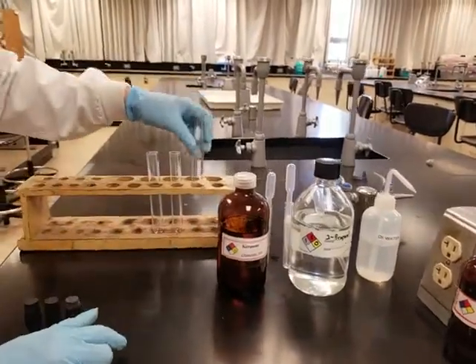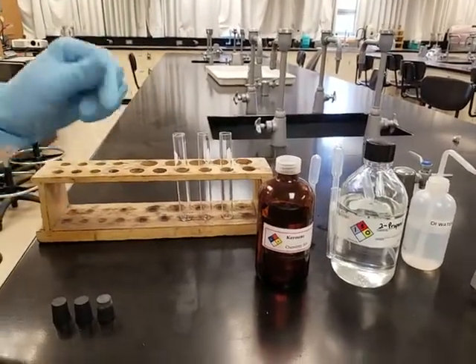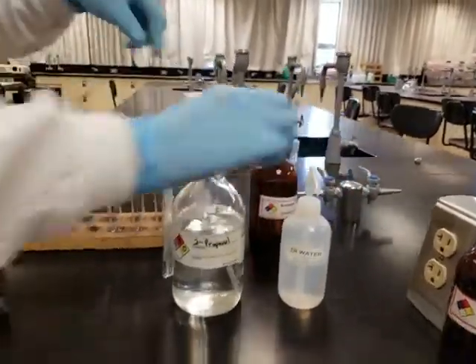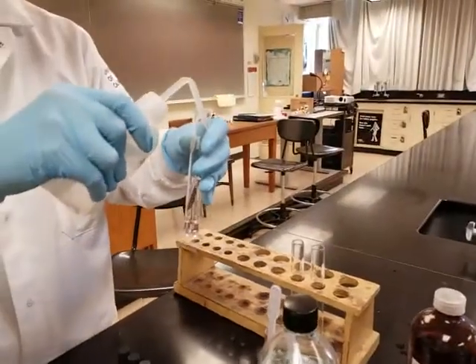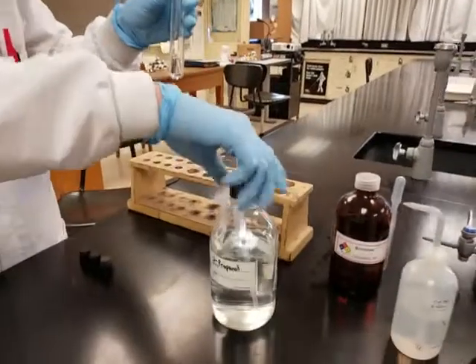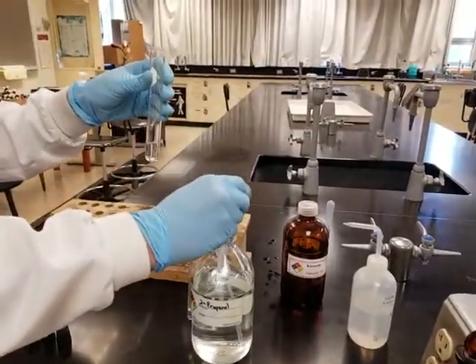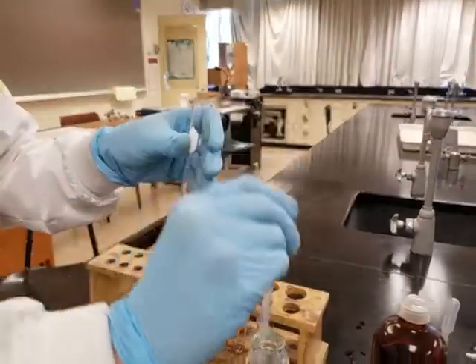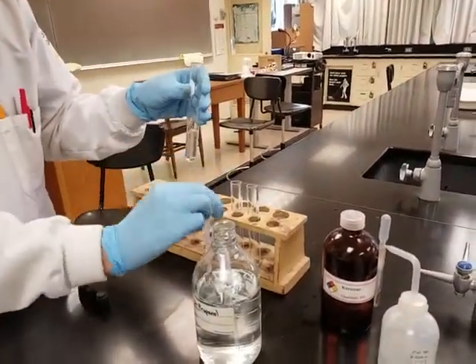Okay, so let's go ahead and get started. That's the whole idea. First up, we're going to have DI water and isopropyl alcohol. These are the two stars of the first test tube. I'm going to put some DI water in, approximately 1 ml. This is more than 1 ml, but you can have a better look at it. And then here is 2-propanol. We're going to get approximately the same amount of isopropanol, about this amount. Allow it to mix.